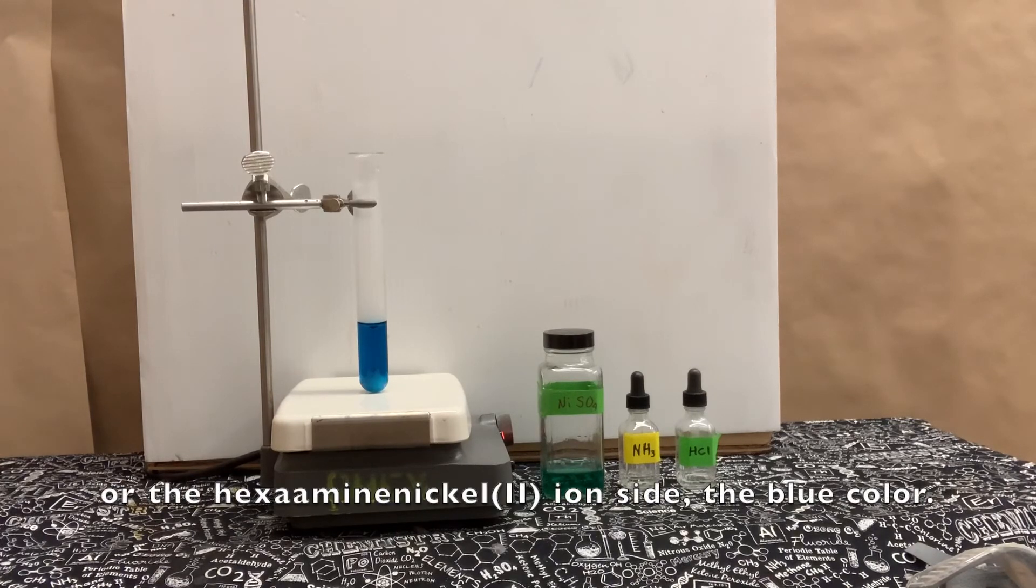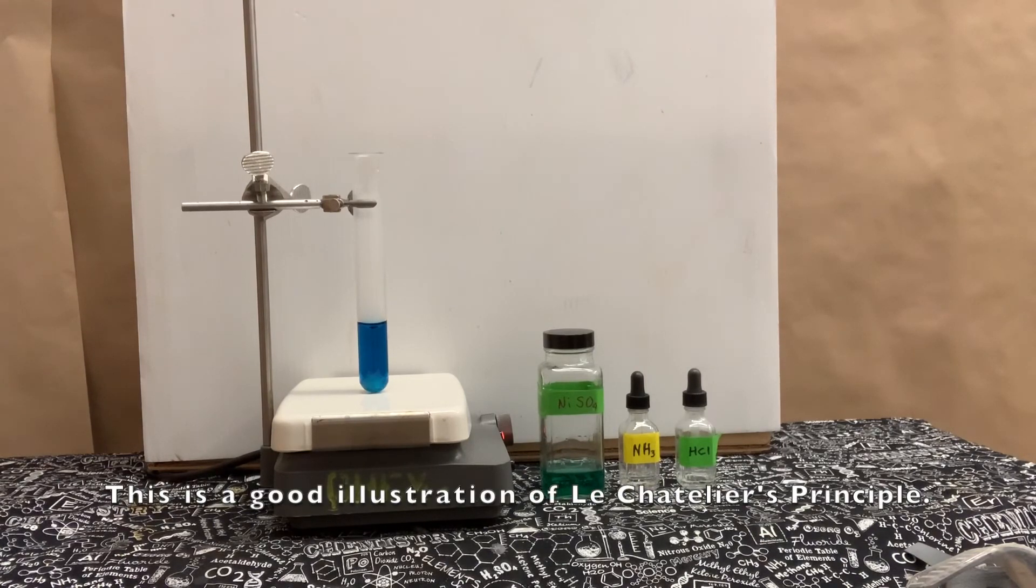the blue color. This is a good illustration of Le Chatelier's principle. Thank you.